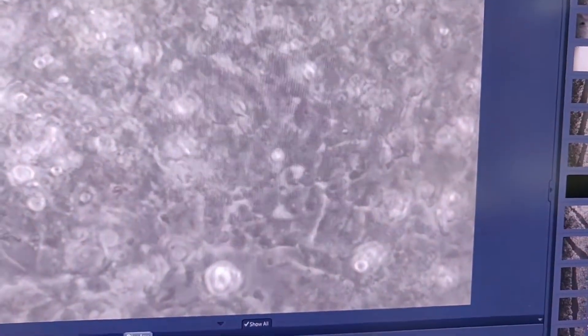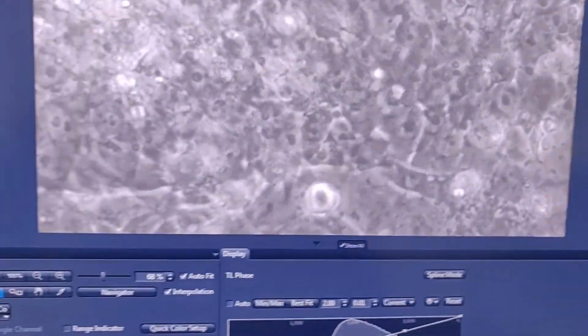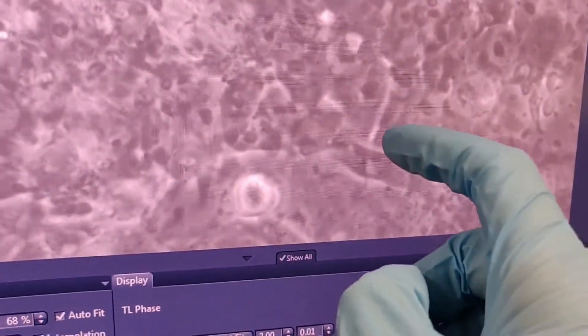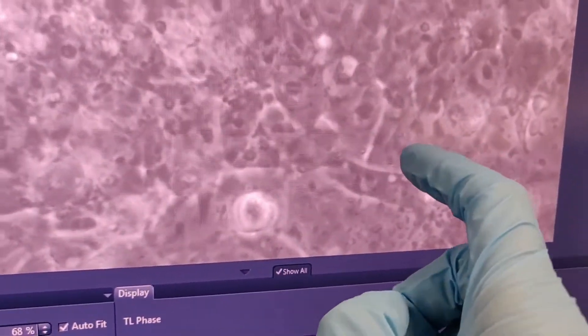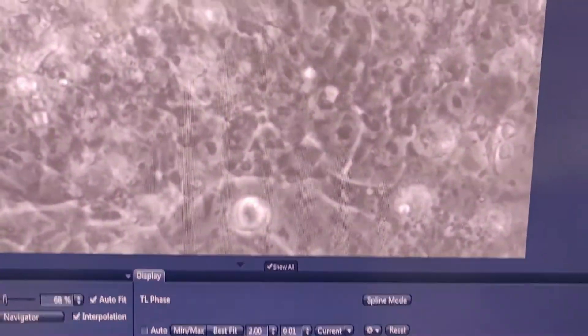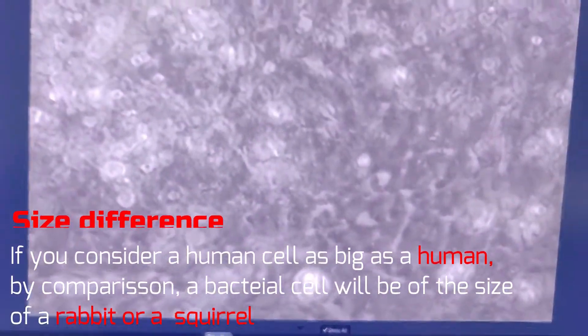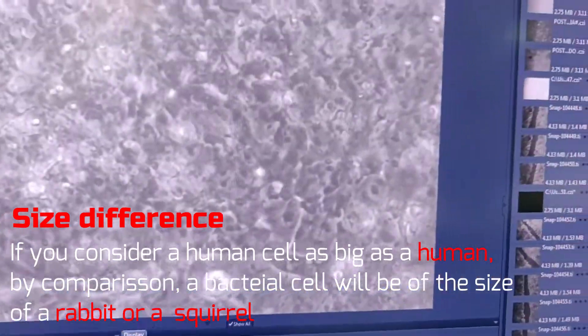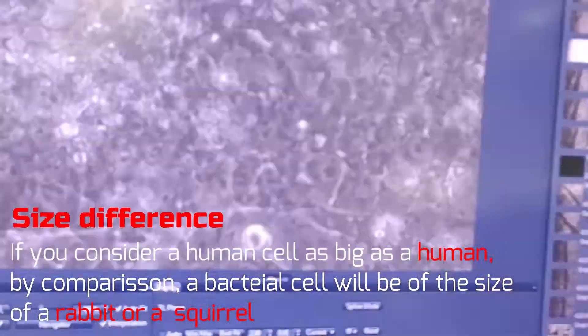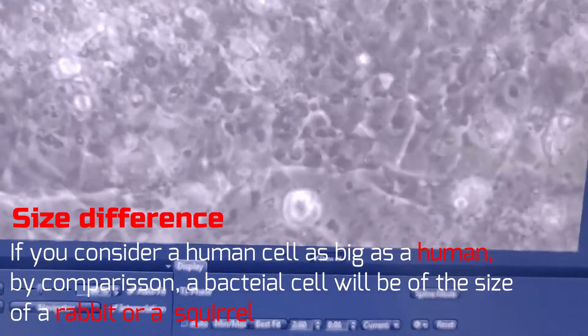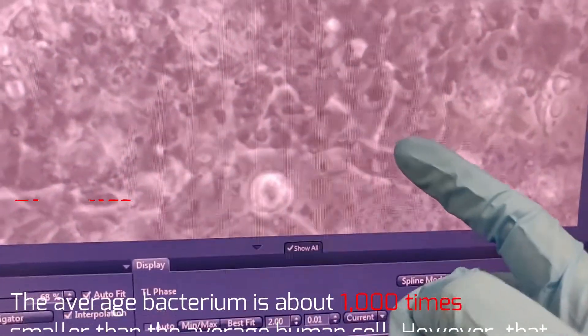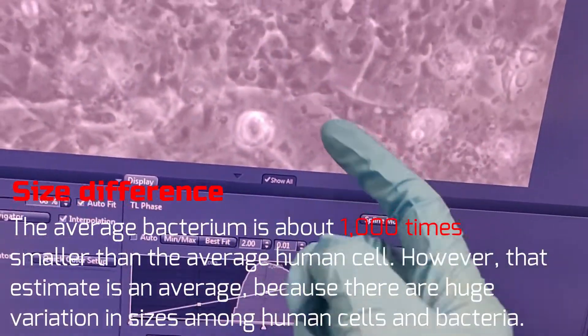But look how tiny those bacteria are compared to cells. Just for a perspective. So, if you can see these all, because these cells are very dense, there are two layers of cells which makes it basically difficult to see. This two is the best. So, you can see. Look, these all. These are one cell. So, these are very big. And one cell in various cells.